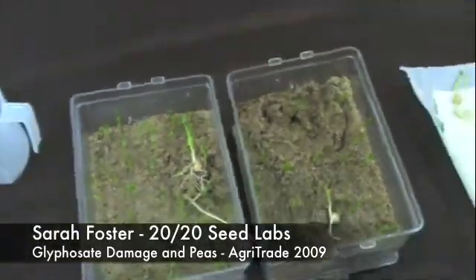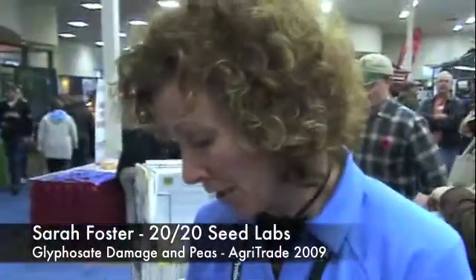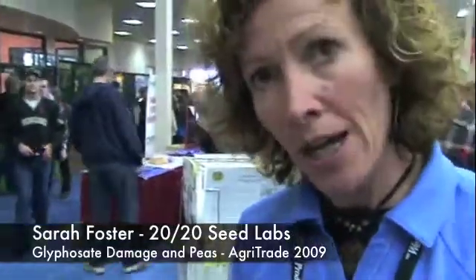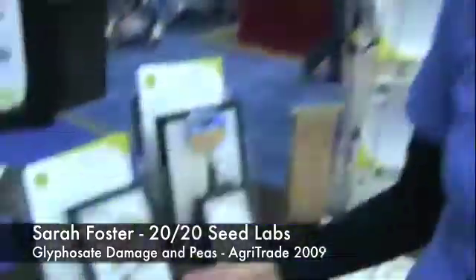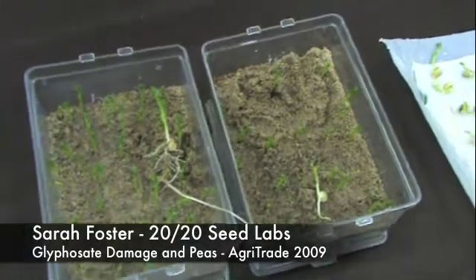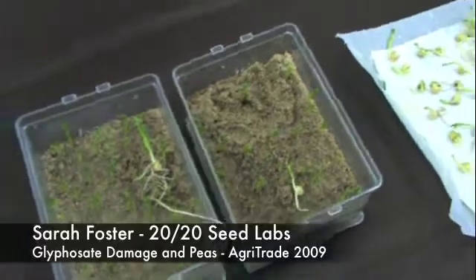You wouldn't know that you had a chemical injury unless you actually started to extract the seedlings from the sand medium. So it's important this year, if you have used a glyphosate-based pre-harvest desiccant, that you get it in for a germination test. A basic germination test will bring this to light that you have a problem.